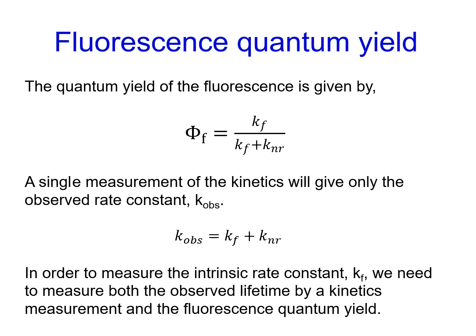In the most general case, there are two competing processes: emission of light by fluorescence and non-radiative decay. Hence, the quantum yield is really nothing more than the ratio between, for example, Kf, the fluorescence rate constant, and Kf plus Knr, the total rate constant for decay of the excited state. We can also see that the total rate constant is the sum of the fluorescent and non-radiative rate constants. In general, it is the sum of all processes that cause the excited state to decay.